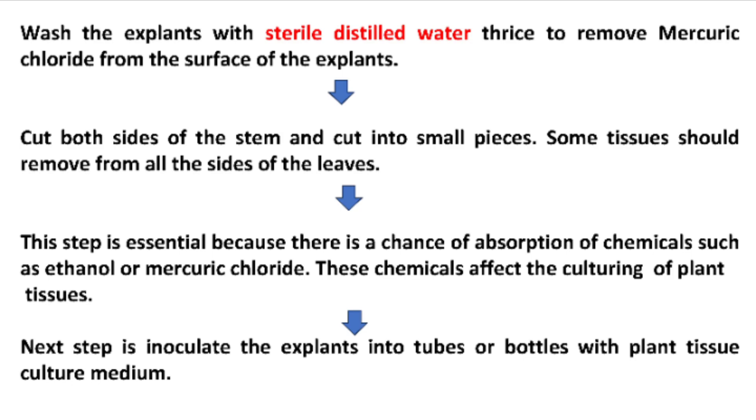Cut both sides of the stem and cut into small pieces. These pieces can be inoculated into the tubes or bottles. Some tissue should be removed from all sides of the leaves — this step is essential because there is a chance of absorption of chemicals such as ethanol or mercury chloride, which can affect the culturing of plant tissues. The next step is to inoculate the explants into tubes or bottles with the plant tissue culture medium.